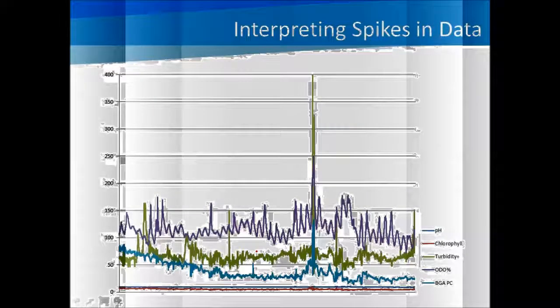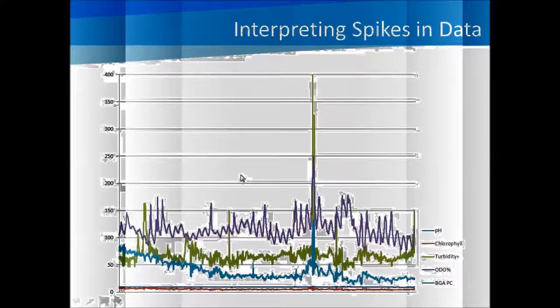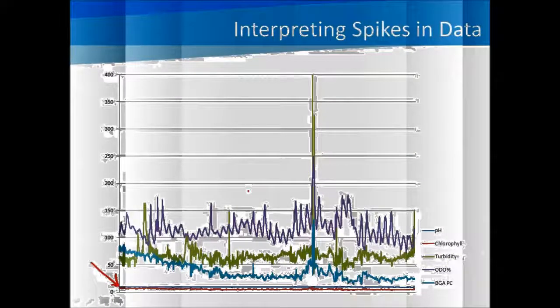You can also see a significant impact on turbidity, which is shown in green. As the cyanobacteria clump together, they will increase the scattering of light and thus cause an increase in turbidity. This is why the turbidity, the cyanobacteria, and the DO readings all spike together. Another interesting point we really wanted to make with this webinar is shown by looking at the algae data through the 2 excitation wavelengths. The chlorophyll channel in red and the cyanobacteria channel in blue vary greatly in the same water.